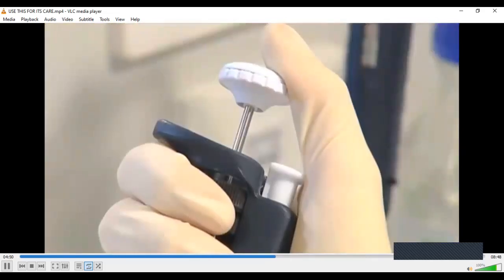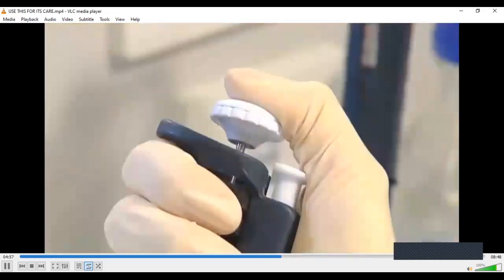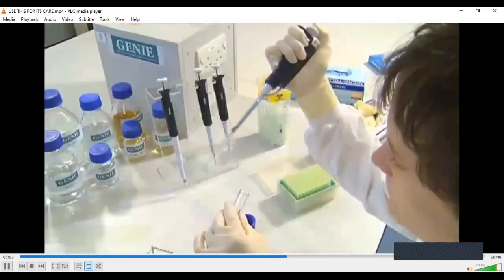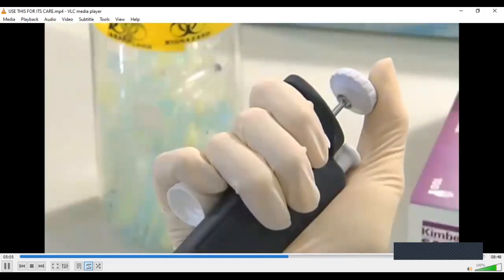Slowly push down on the push button. This will release the liquid in the pipette tip into the tube. This time push beyond the first stop. This ensures that any residual liquid is expelled from the pipette tip. Fully withdraw the pipette tip from the liquid before you release the push button.